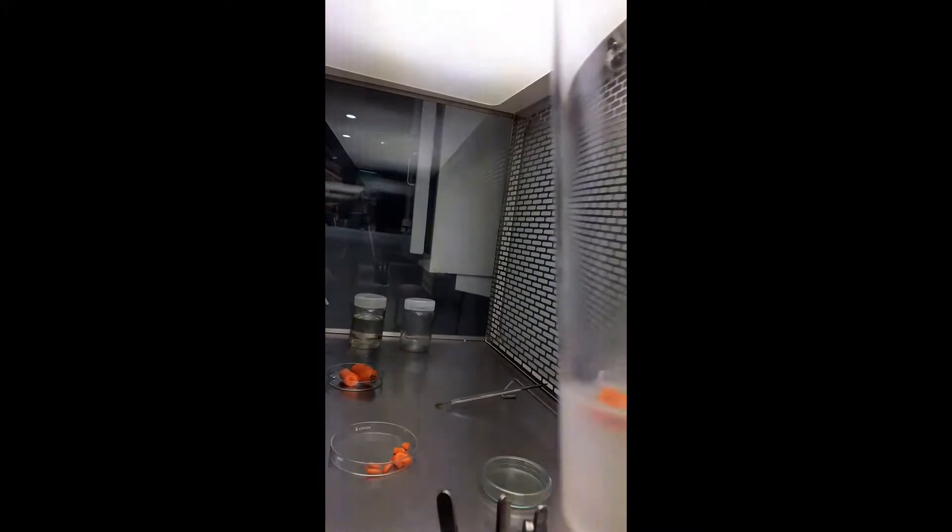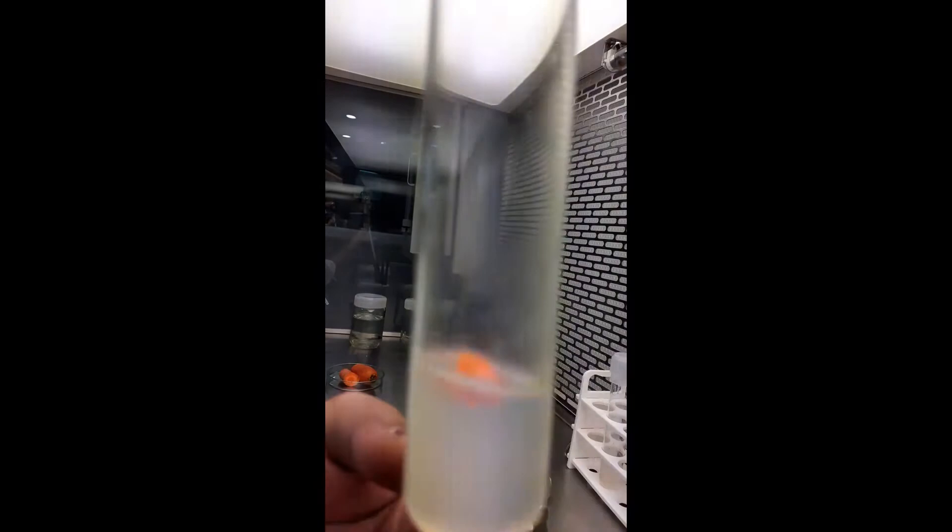It is half embedded within agar and half above. This is how you have to initiate the callus culture using a carrot explant.